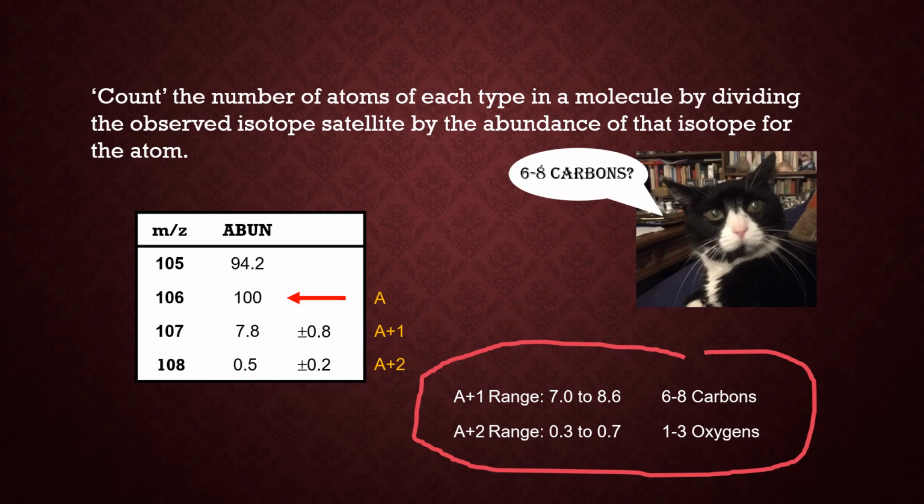So we're going to come up with multiple guesses, multiple empirical formulas that satisfy at least the first set of lines in the mass spectrum. And then we're going to go down the line eventually to refine those guesses and hopefully rule out a few. And this will even work better if we have more spectroscopic information, such as infrared spectra and NMR spectra.